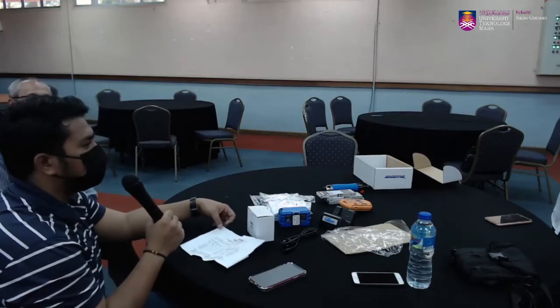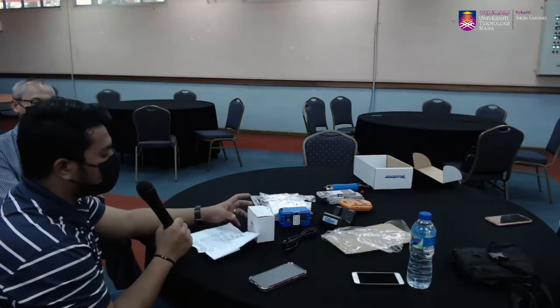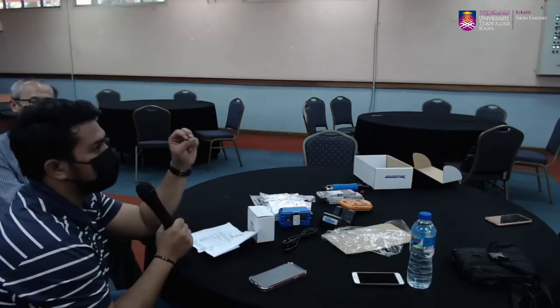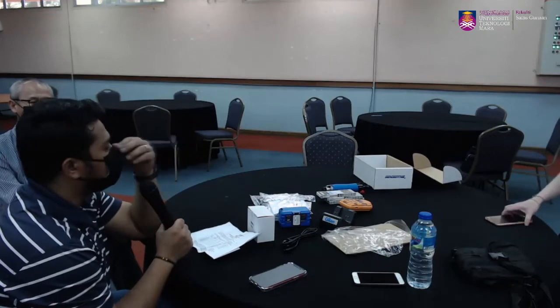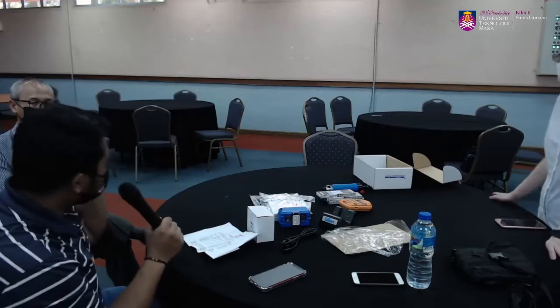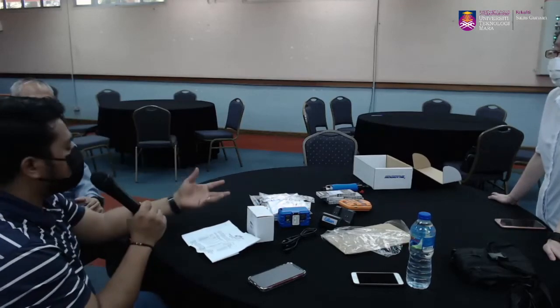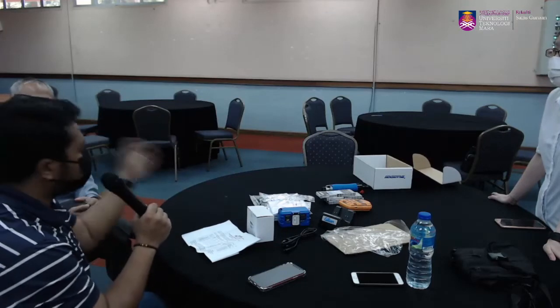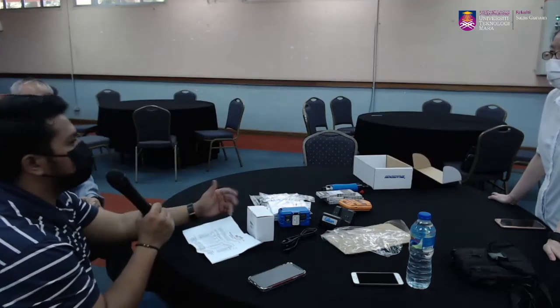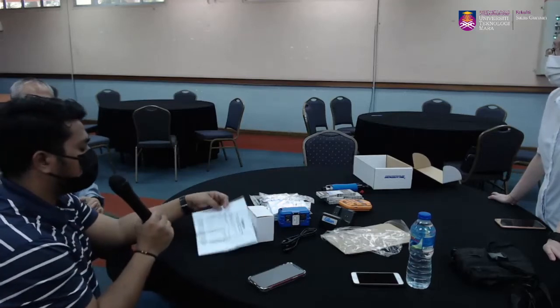So kalau usually-nya kita nak identify kita perlu service atau tak, bila kita tengok dia susah nak reach dia punya targeted flow rate yang kita dah set. So kalau once dia dah susah nak reach and then bunyi pump dia pun macam semput, then you boleh try and change the filter dulu. Kalau you nak terus hantarkan kepada kita pun, kita boleh do everything lah. Kita akan tukar filter, kita akan clean up the inside, dan kita akan bagi you in terms of service report lah, macam mana peralatan tu function.